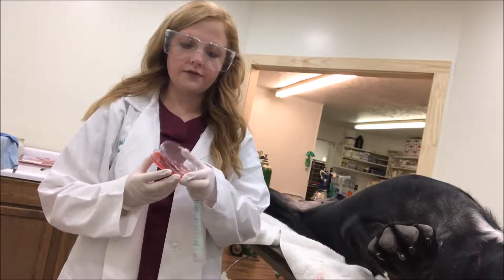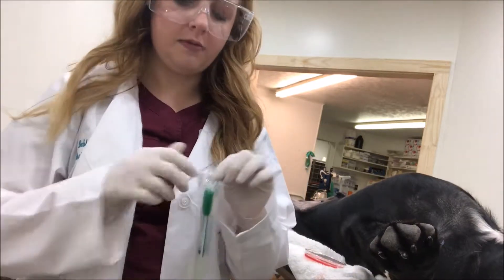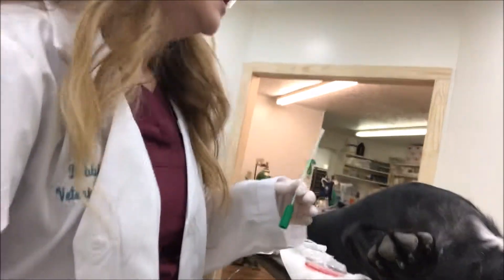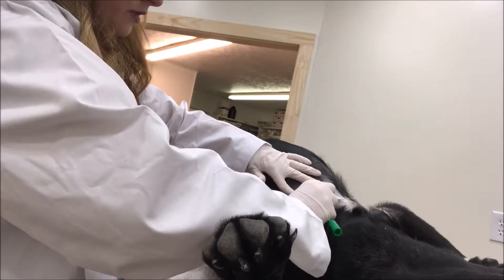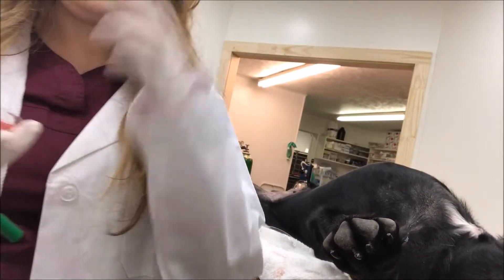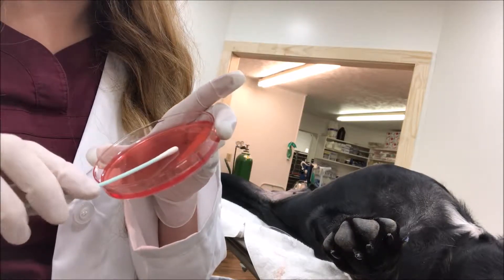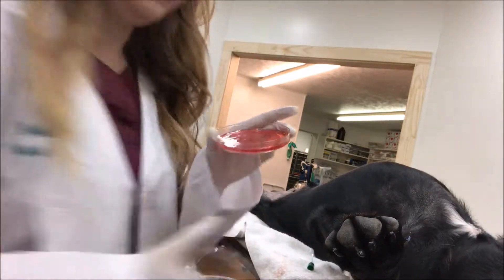Now we're going to use our friend here and get our bacterial culture. I have my agar plate and I'm going to use a sterile swab. He's got some pretty nasty skin, so I'm going to pick this spot right here and just rub the swab around on it. Now I'm going to get my petri dish with the agar and roll the swab around on it. All right, we're ready to incubate this.